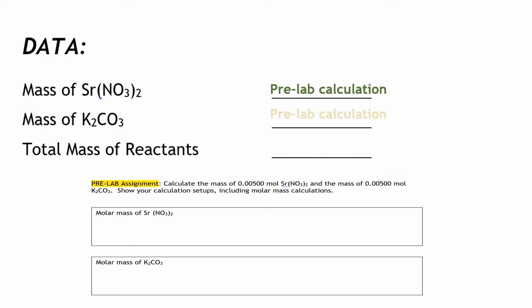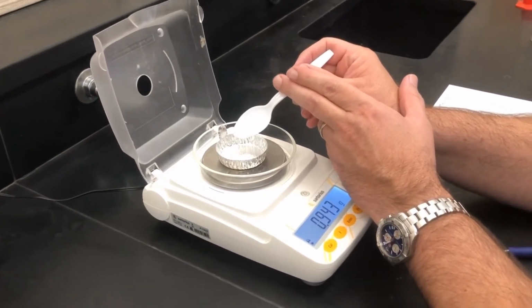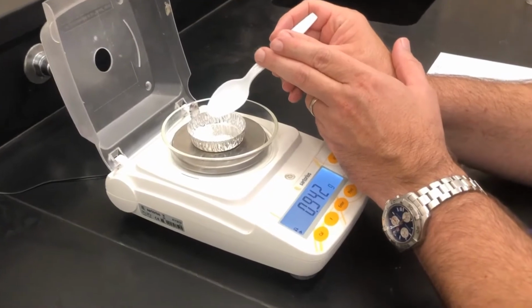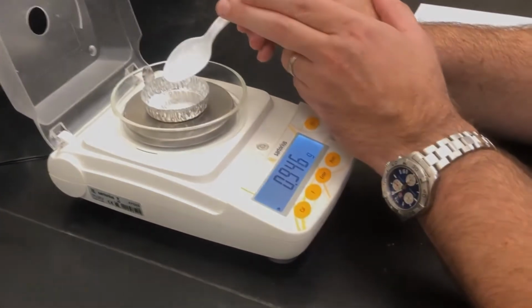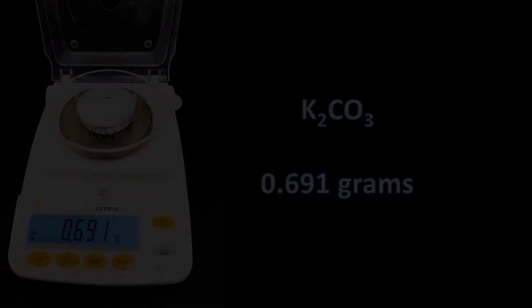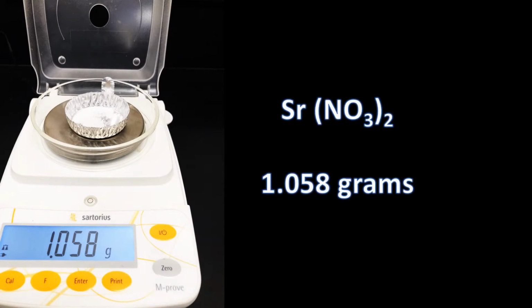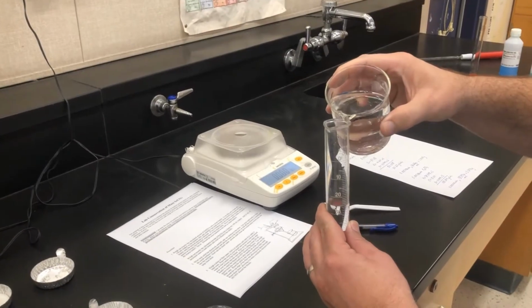Prior to the lab, you should have calculated the mass needed to obtain those concentration solutions. Preparing them will require care down to the thousandth of a gram. The mass of potassium carbonate required turns out to be 0.691 grams. And for strontium nitrate, we measured a likely 1.058 grams.